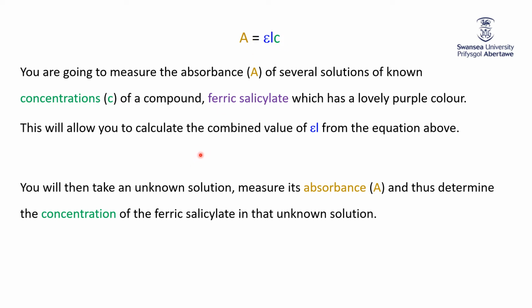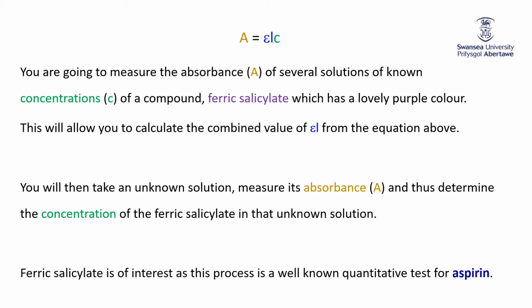Now this is a particularly useful little process because it's actually used to test for aspirin. Ferric salicylate is of interest as a test for aspirin.